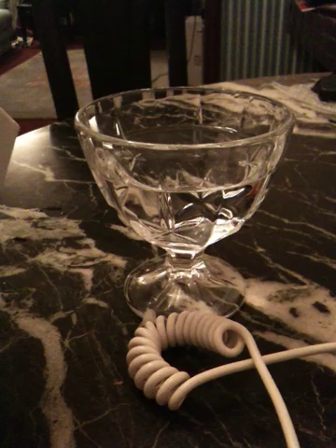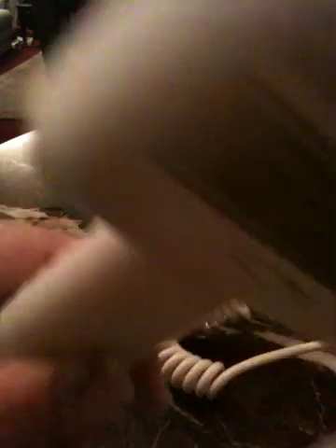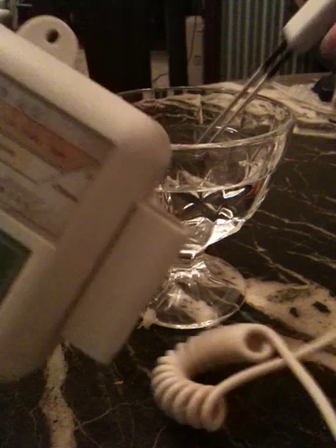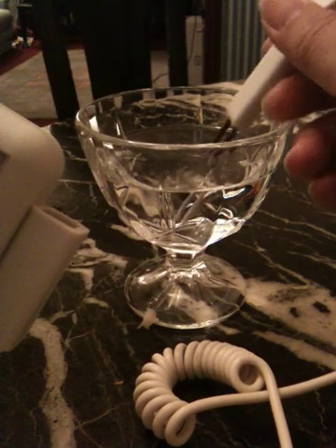Now to find the adjustment level, make sure the battery is 100% inserted — it's very important. Then put the probe into the water until the black rubber level.